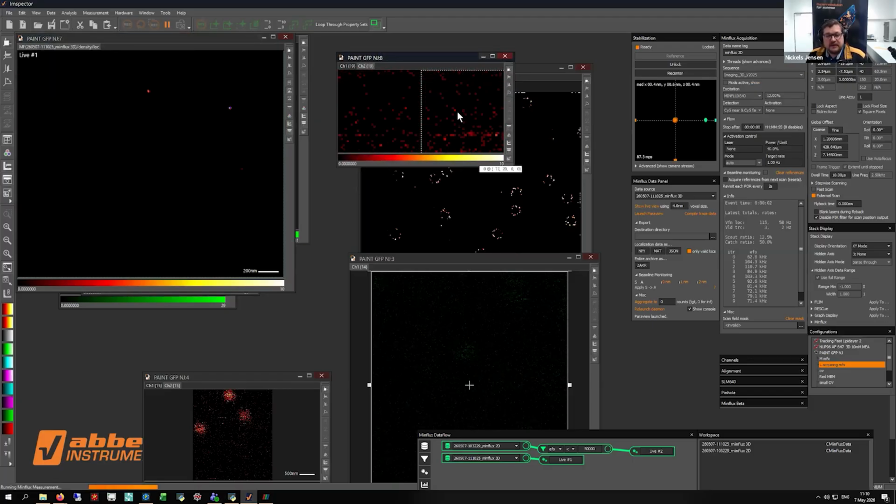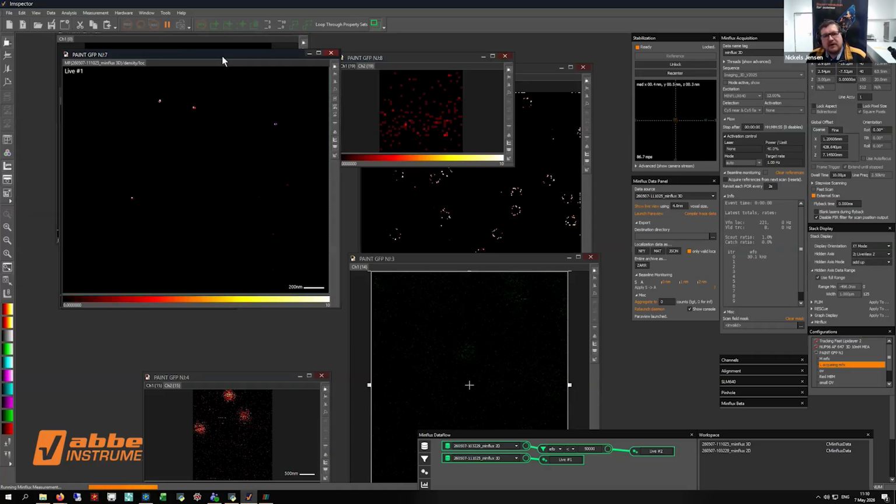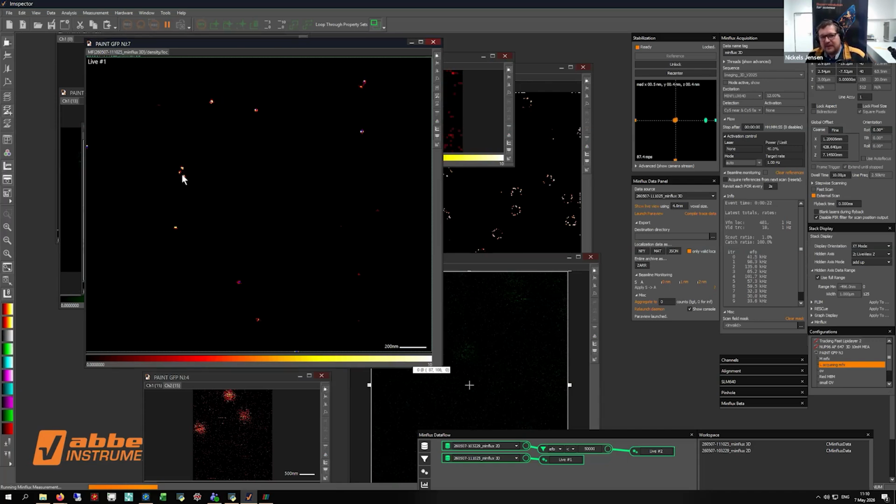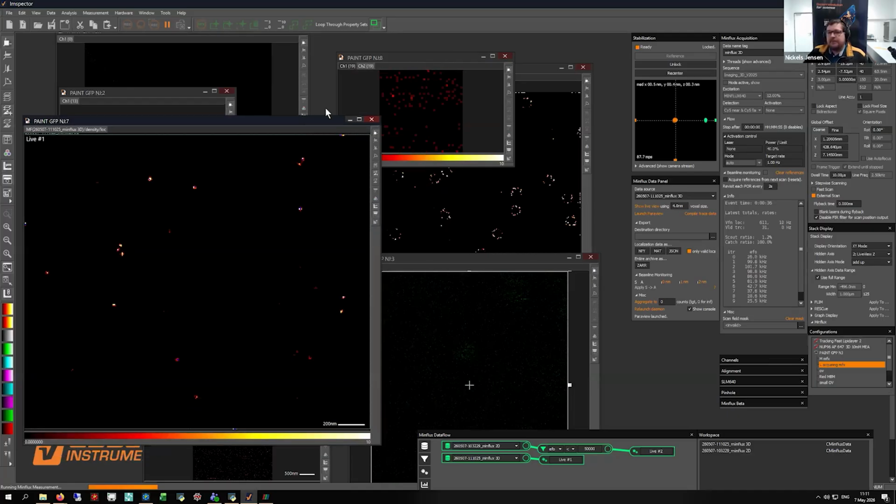And what you see now is, again, this blinking window. Every time you see a blink, a molecule is localized, and you already see here this live view. Every time we have this blinking, a new molecule or several new localizations are found and are plotted. And here you already see in the beginning the nuclear pore starts to come. The sample is always scanned from the top right down, and every time it finds a single molecule, it localizes it. And when it's at the bottom left, it starts at the top again. And by this, the image builds up slowly. We will come back in a moment to look at this.